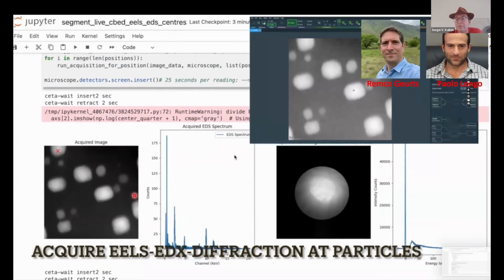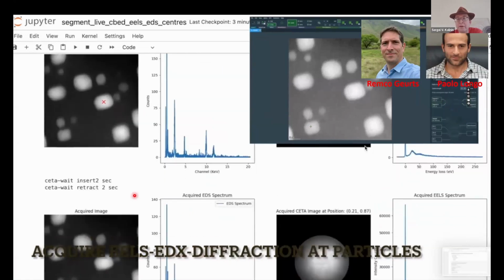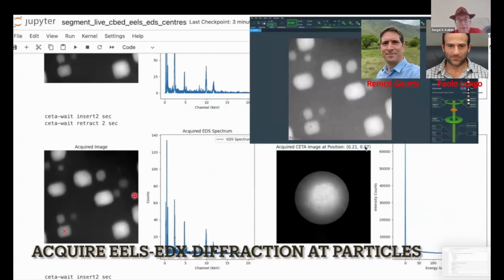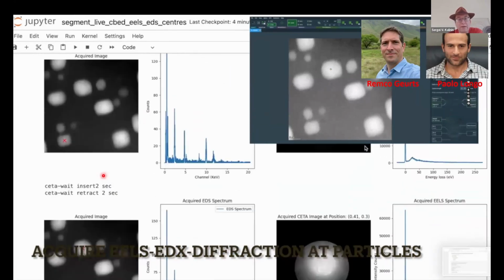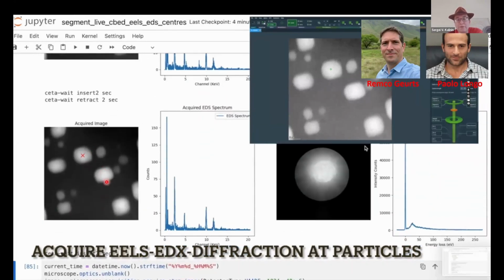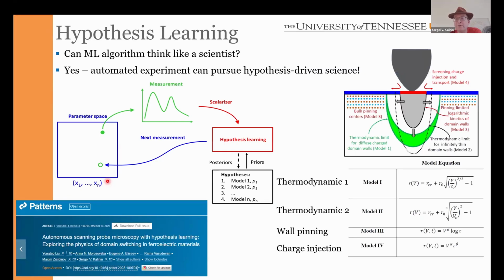So this is the example of the fixed policy experiment. We know in advance that we are interested only in the particles, and essentially we don't want to waste experimental time in studying things on the grid measurement. We don't want to do the point and click. Our machine learning agent is going to take measurements for us because we specify what it is that we want to accomplish.